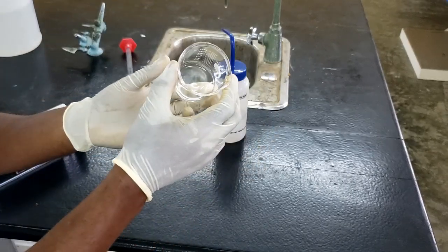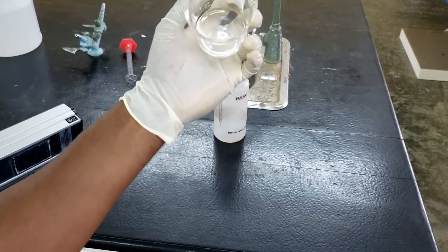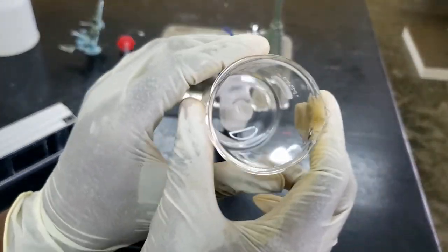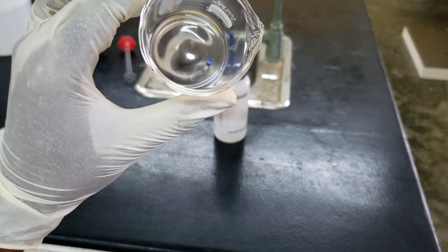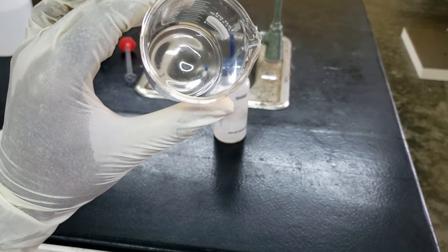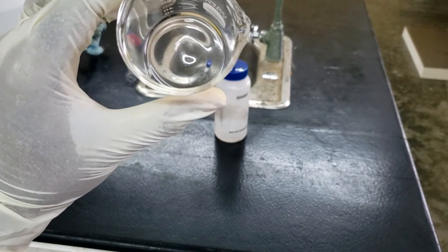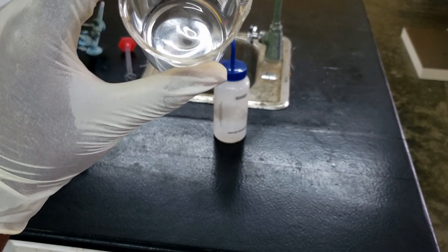So if you look closely, you might just see some of that residue at the bottom of the flask. Let me see if I can focus the camera on that. Remember, it was not a lot of the p-bromonitrobenzene that we added, so we don't expect to get a lot of solid back.